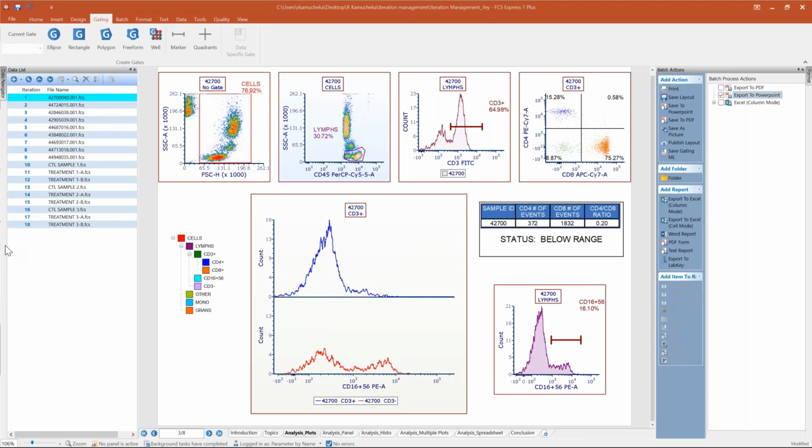Here's a good one. What causes some files in the data list to be grayed out after certain actions? It seemed random to me with the examples. Is it because those actions are not available for those files, maybe because those markers were not used?